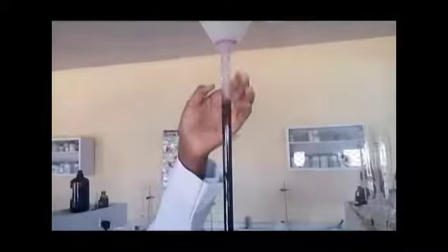So our solution exceeded the 0 meniscus level on our burette. So what I'll do now is to start reducing it to reach the 0 meniscus level exactly. Before I do, I have to remove my funnel so as not to affect our video. So now I release my burette tap. So this is now the 0 mark point at 0 meniscus level. I'll hand over to my classmate to continue from here.